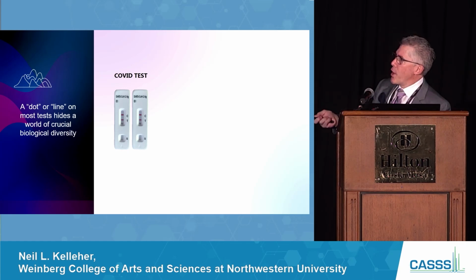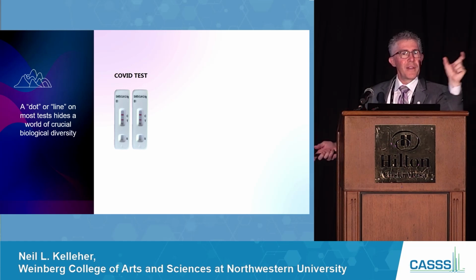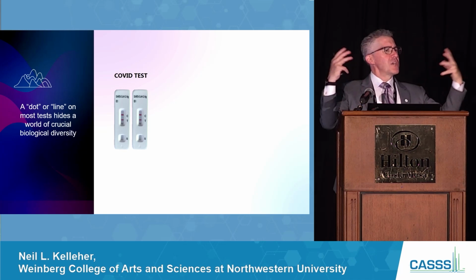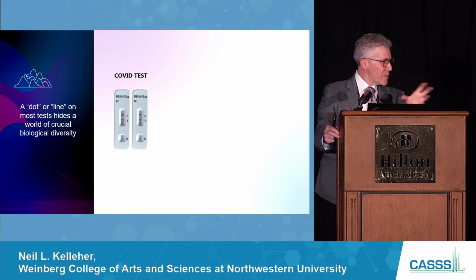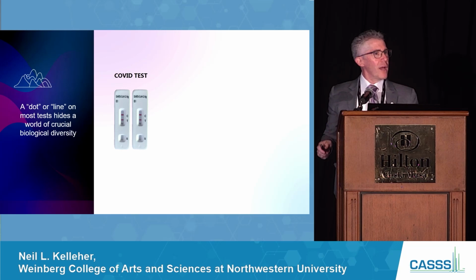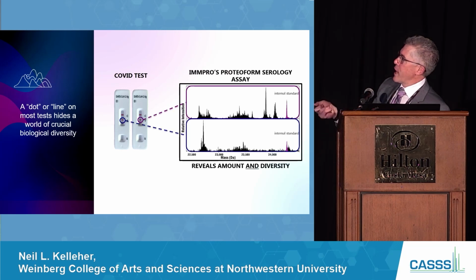Well, what had happened here? You put an antigen on the LFA, the lateral flow assay, probably the spike protein of the virus, to attract the IgGs. So that's this experiment. Now I want you to think about whether you could resolve single clones, single B-cell clones, from a sample like that, treated like that, where you do an affinity capture and then read it out with single ion mass spectrometry. And it looks like that. There's your kappa and lambda.